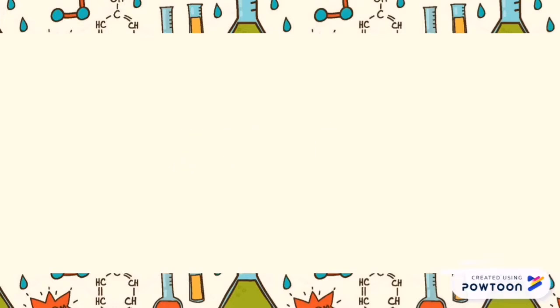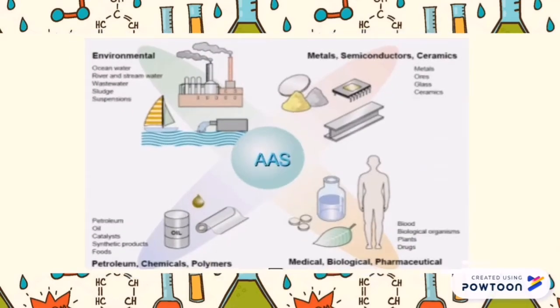Application. Atomic absorption spectroscopy can be used to determine small amounts of metals such as lead, mercury, calcium, and magnesium in several samples from several sources. The first source is environmental, which comes from ocean water, river and stream water, also wastewater.